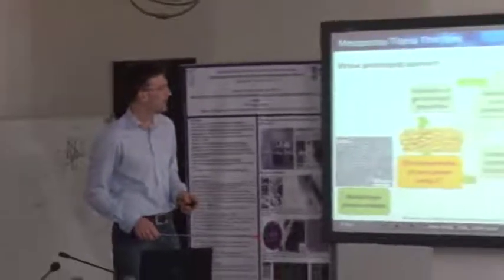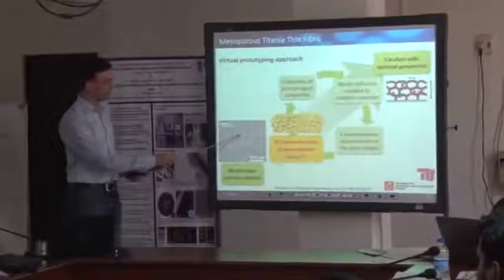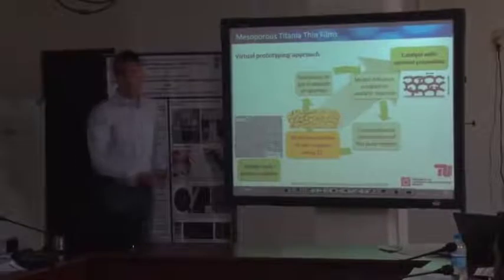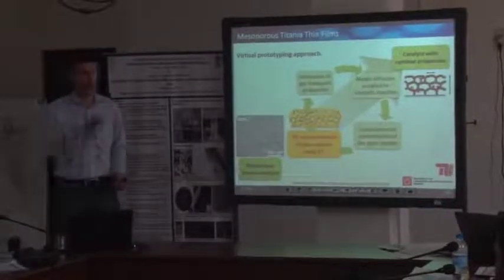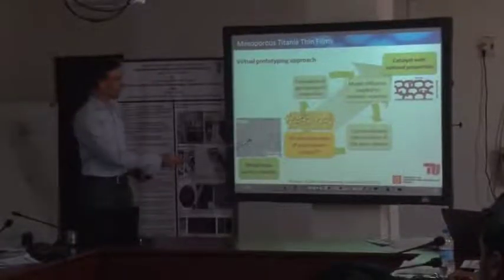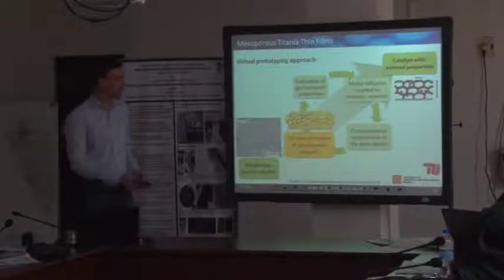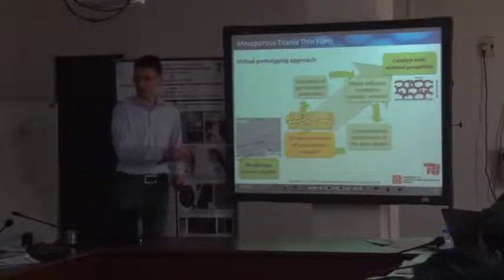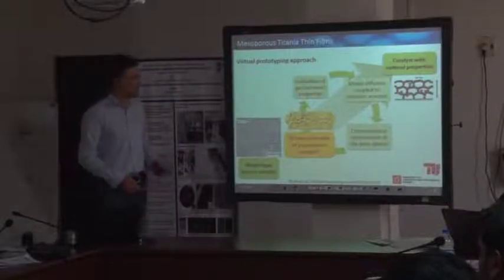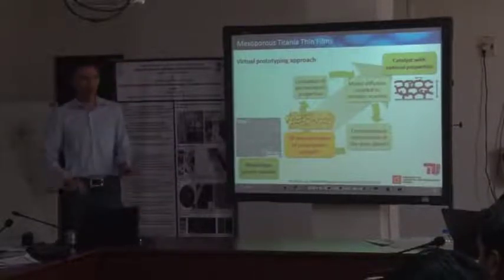There's one example that I already showed. It's this open porous titanium oxide. There's a thin film on the surface, and those pores are connected. This particular sample was prepared by templating tiny spheres, and then there was probably some sol-gel coating to generate these open porous titanium oxide films. The question was about gas transport for catalytic reactions, so there's interest in this property, and it was about the optimization of the pore structures for the application.